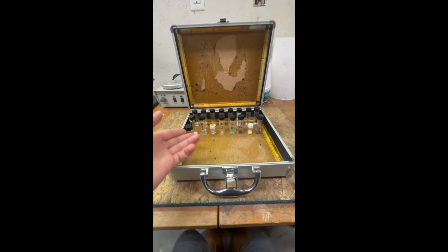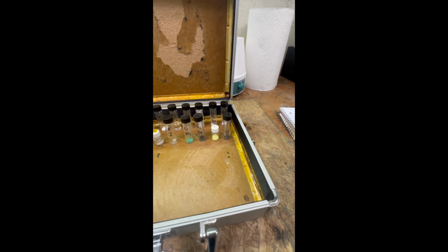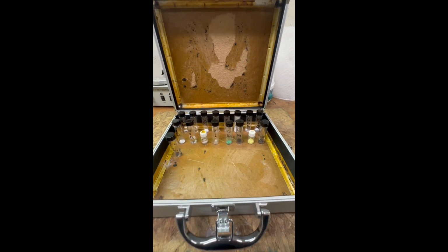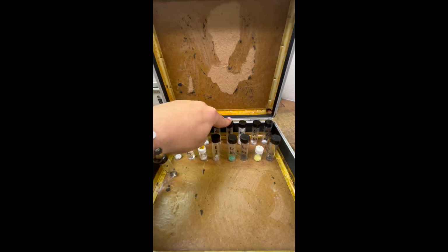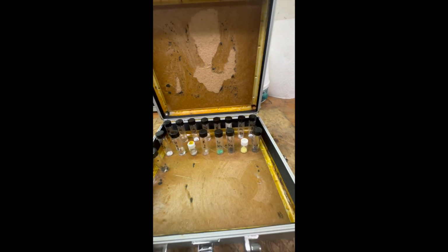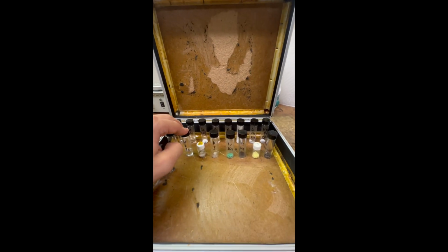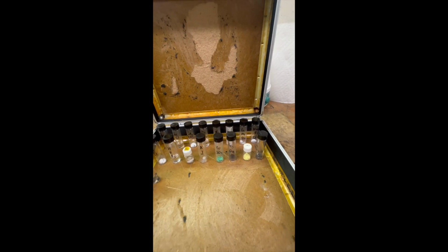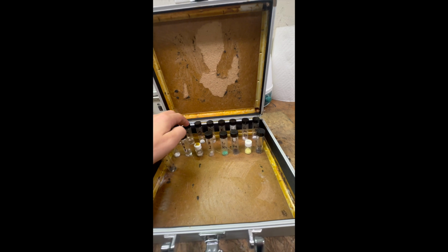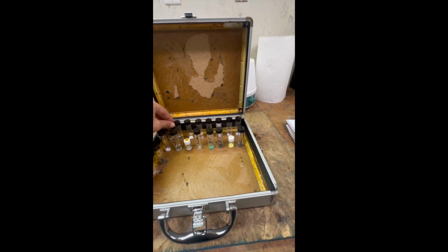I have iodine that I distilled. I have some raw iron nuggets from thermites. I have some potassium nitrate that I synthesized from the nitric acid and potassium hydroxide. Nitric acid I used to make my copper nitrate, and I also have the HCl that I used in my gold extraction from computer parts.